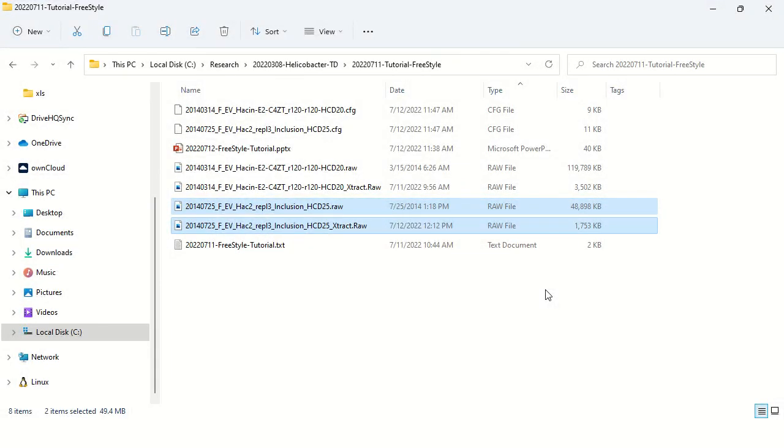This raw file is not just changed in name very superficially, it's also changed dramatically in size. And something I'd like you to remember here is that deconvoluting a spectrum, generally speaking, is going to drastically reduce the number of points recorded. Generally speaking, broadly, we often find that people collect top-down tandem mass spectra in profile mode.